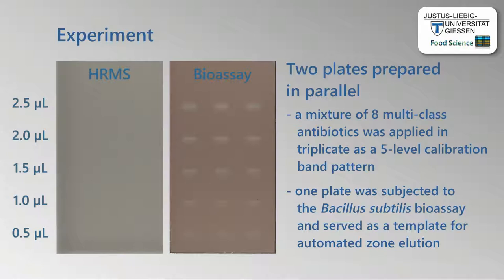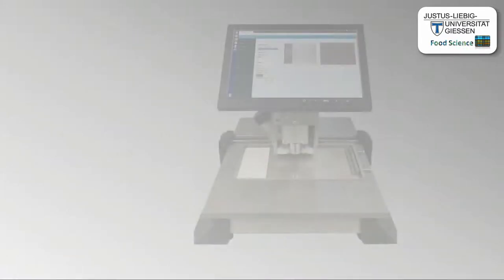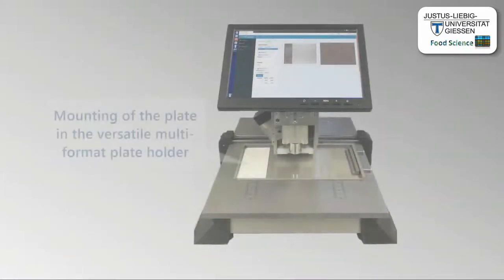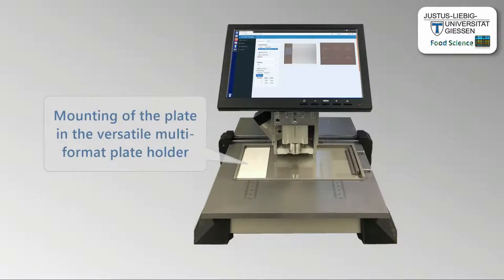The antibiotic zones are visible as bright spots on a reddish background. The 5x10cm plate for HRMS was mounted in the versatile multi-format plate holder with the help of an additional glass plate to avoid shifting during the measurement.